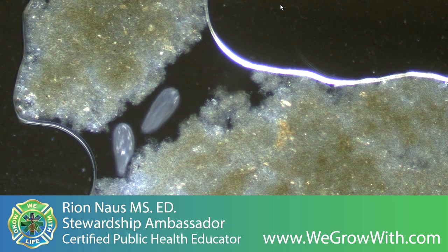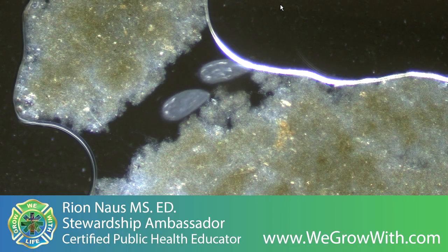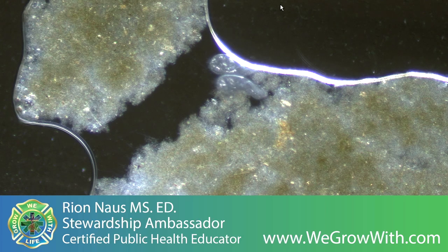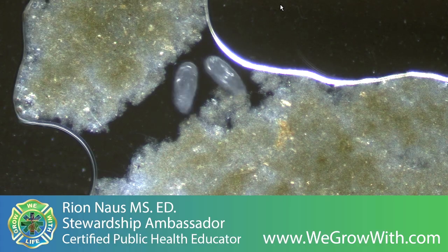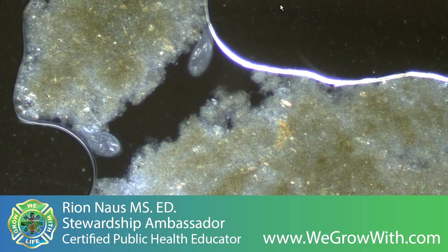Because some of the things that maybe initially I thought were just a fulvic or humic acid, now we realize that fulvic and humic acid actually might have been a ciliate or a testate amoeba or some other thing in a protective state.